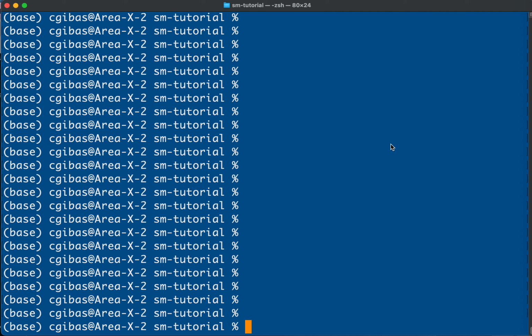The combined abundance table that you just produced for all your samples using merge_metaphlan_tables is a flexible format. It's a white space delimited file that you could import into Excel. You could turn it into an R or Python data frame if you know how to do those things. So there's a lot of different analysis that you can take that table forward into, and we can't explore all of it today in the tutorial, but what we are going to do is make a heat map.